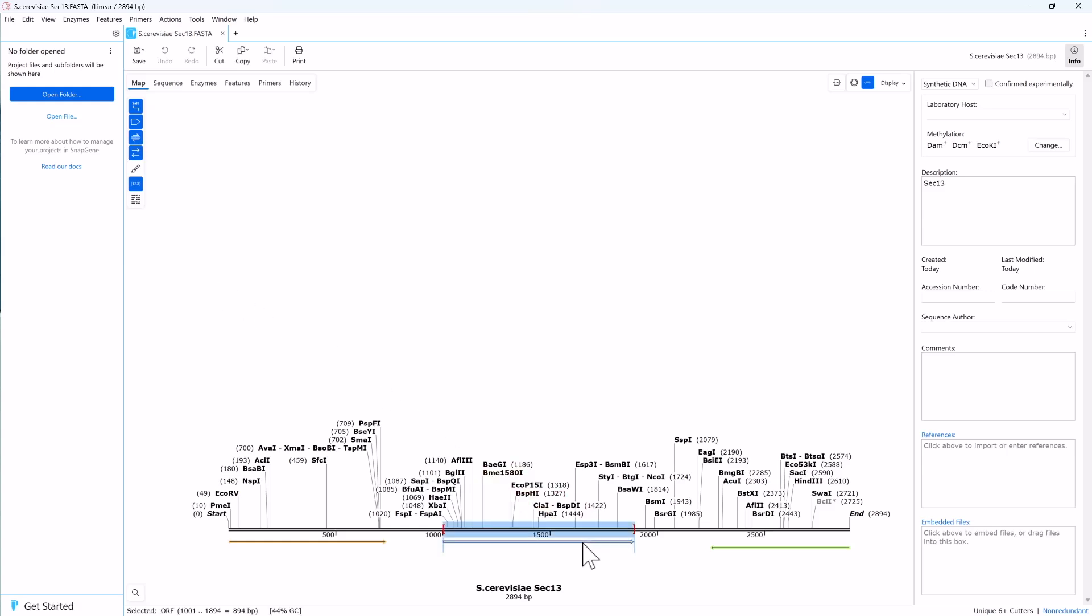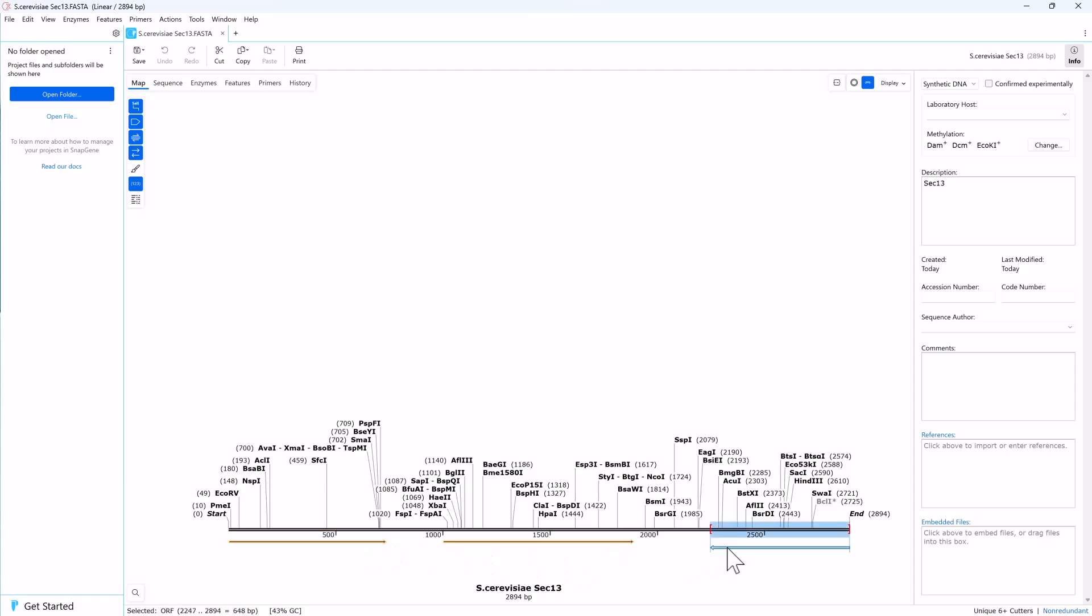In this example, the orange ORF in the middle is sec13. There is another forward open reading frame to the left of sec13 and a reverse to the right.